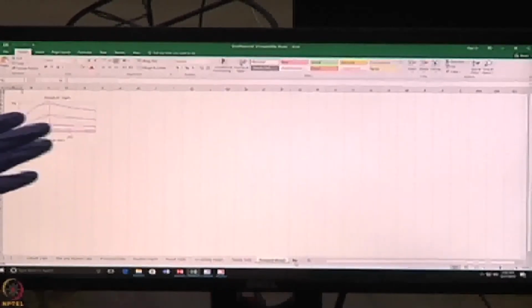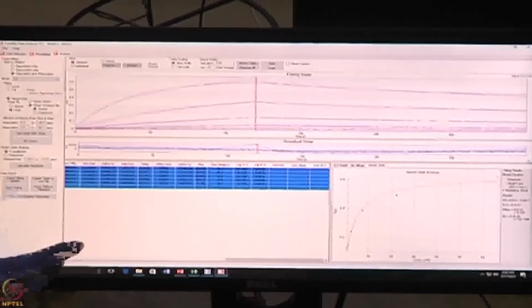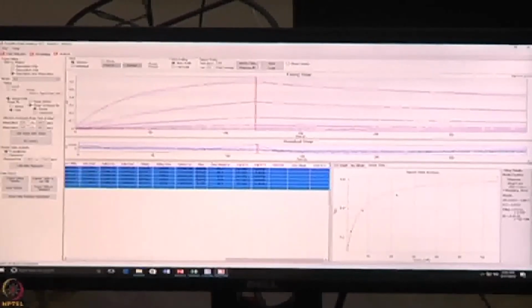And the group view, if you are performing some other kind of presentation, or when you are running different batches, you can get the sensorgrams. So these are the report formats, and a good advantage is that you can use these fitted results in other software. Suppose you want to review or analyze this data in the BIAcore software, yes, it is possible. Or if you want to use a Scrubber third-party software, yes, you can do that using this. Multiple options are there.